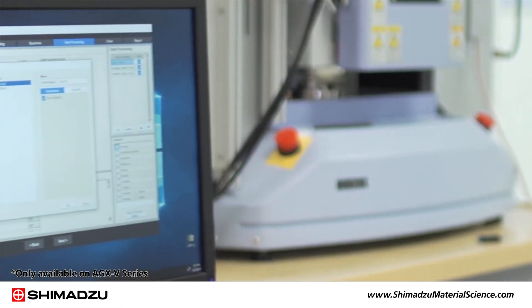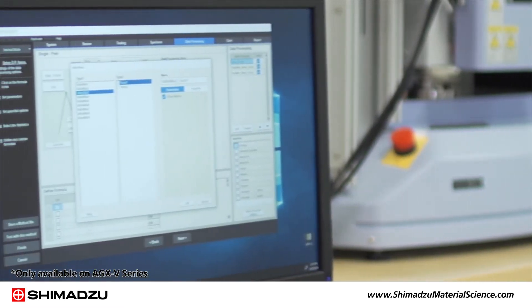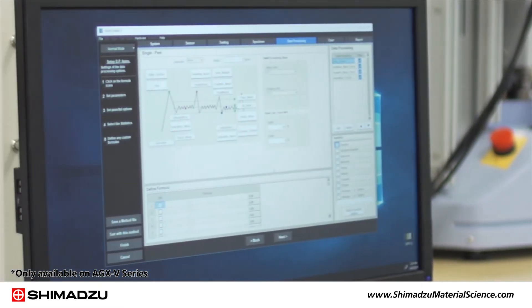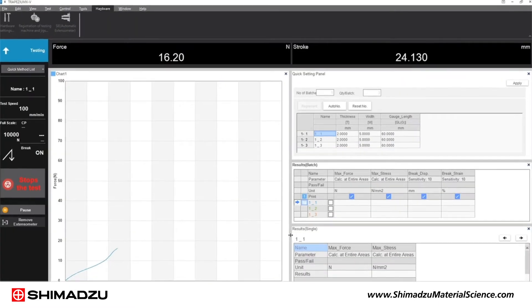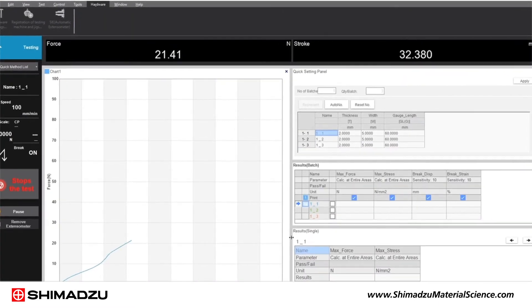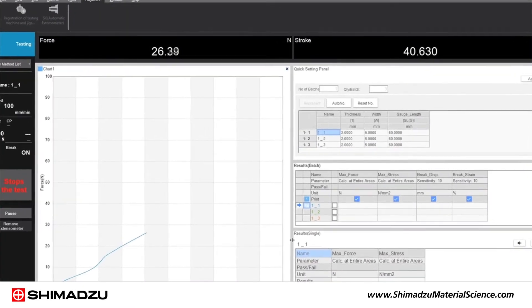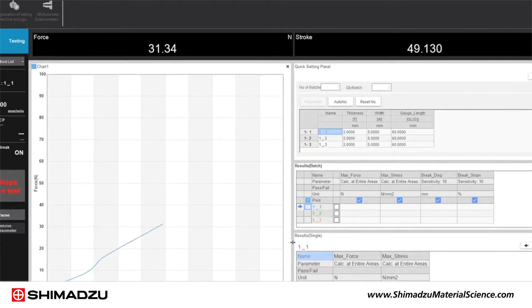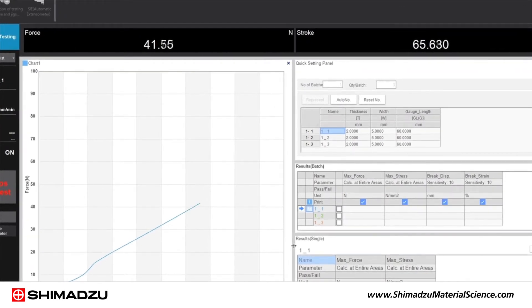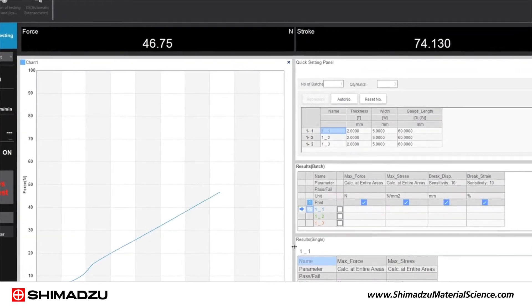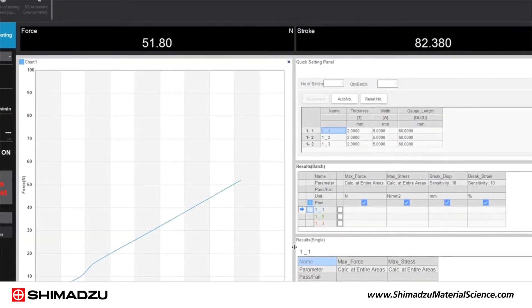Trapezium XV also accepts additional inputs for strain gauges and other accessories. Test progress is displayed on screen. The graph window shows the testing data and the sensor bar displays the measurement value in real time.